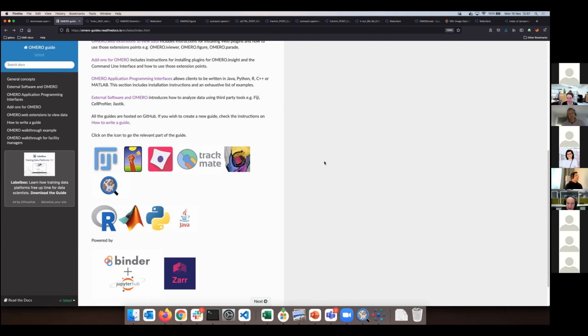The OME team is able to do what it is able to do, and it has its priorities. In the past, the OMERO Insight was the main client, so to say, and the most energy went into that. But there are many technical and other reasons why the OME team said, well, now the OMERO Insight is deprecated. And you would say, oh, then rewrite everything into OMERO Web.